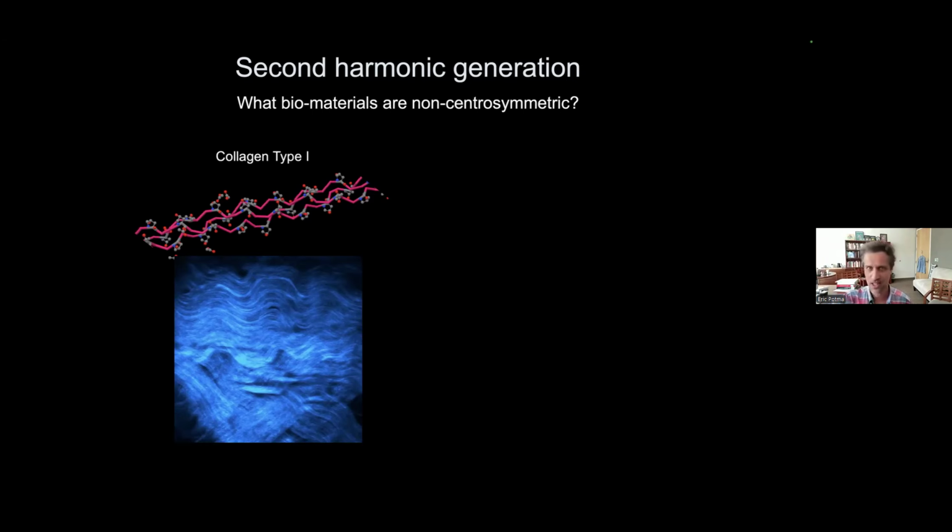On average, this non-centrosymmetry disappears. Sorry, I said it the wrong way. The problem is that so many molecules contribute in your focal volume that this very specific case of centrosymmetry disappears due to averaging of the orientations of all the molecules together. So even though almost all individual molecules are able to generate second harmonic generation on their own, if they are with a lot of peers with different orientations, the orientation factors into the phase of the light that comes out.